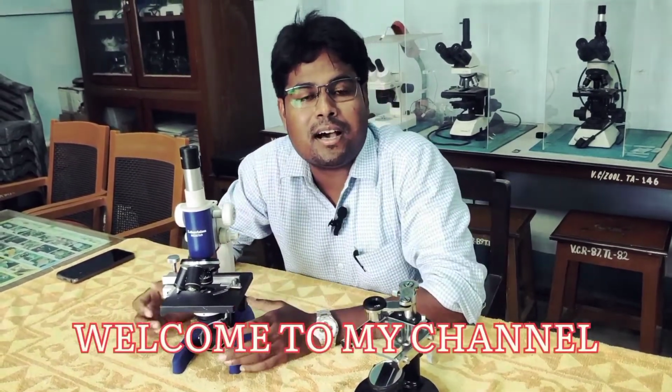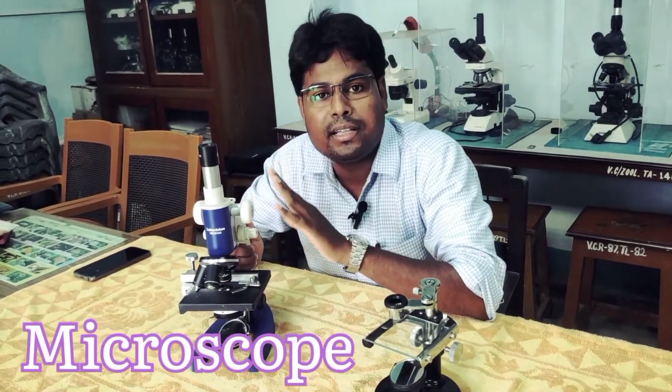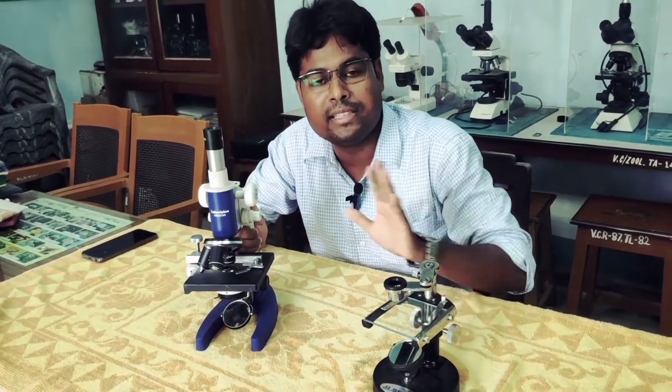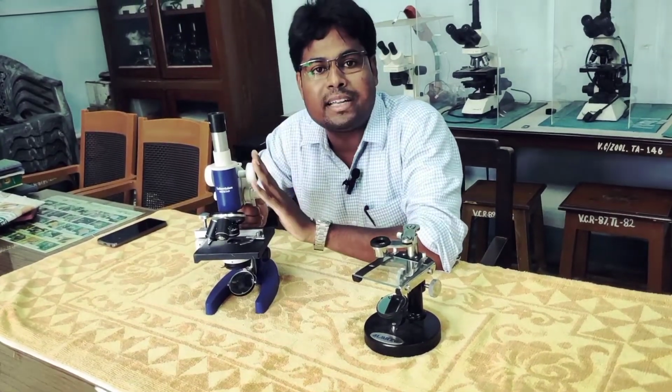Today I discuss a very important and essential instrument that we have used in the laboratory. Yes, this is a microscope. This is a compound microscope and another is a simple microscope. Today I discuss both of them, and first of all I must discuss the compound microscope, its parts and their functions.